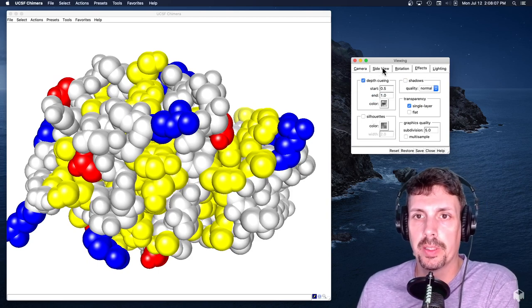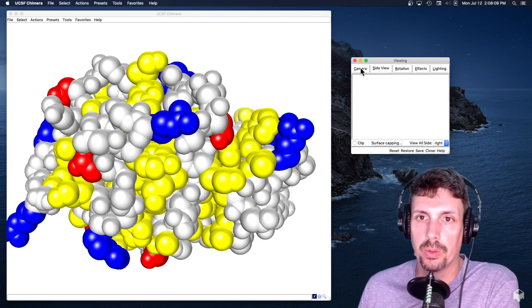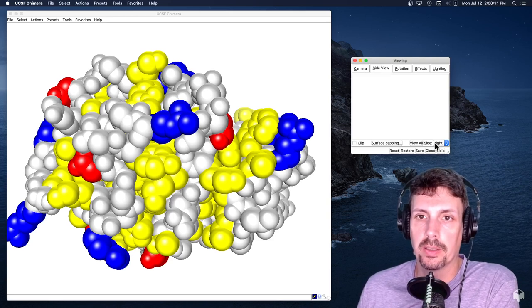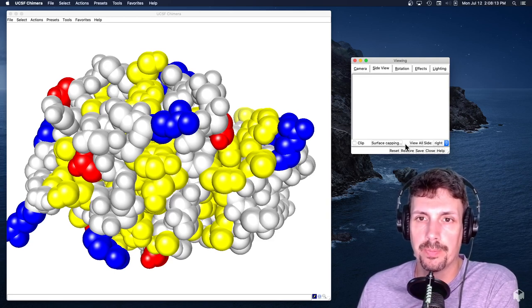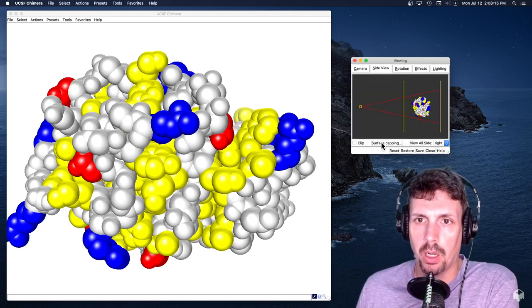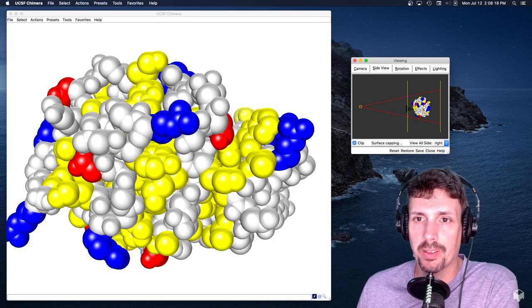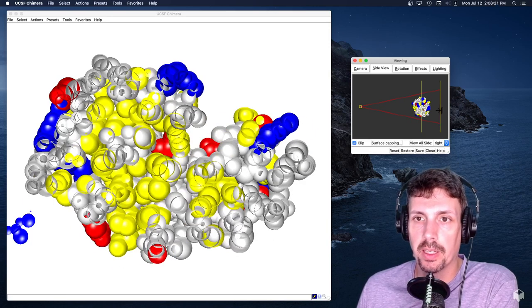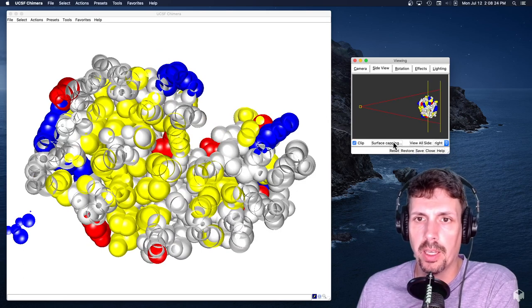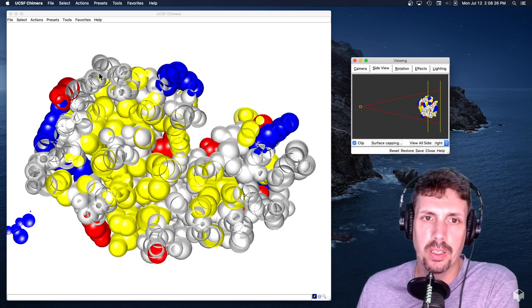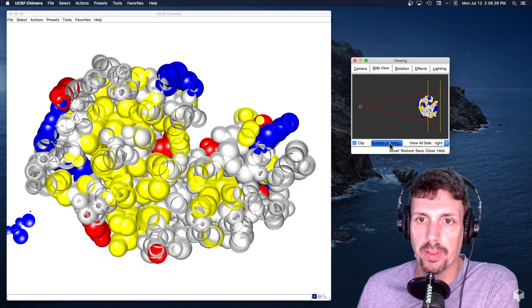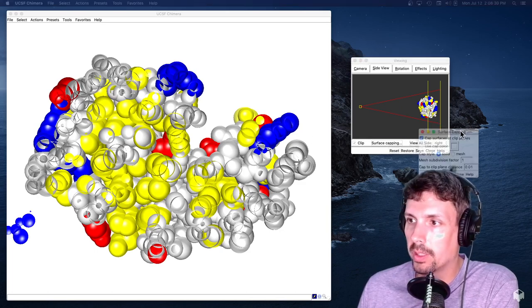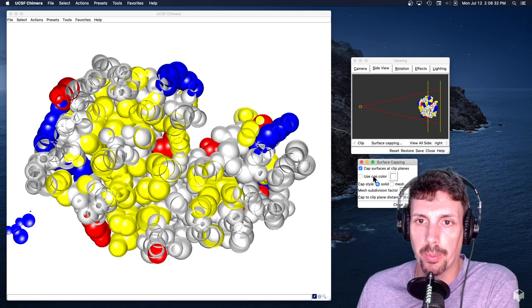So what we're going to be doing now is work on the side view. Sorry, it takes a little bit of time to load. All right. And so what I'm going to do here, I'm interested in looking at what's inside. So I'm just going to kind of slice through the middle of our protein. And it looks kind of weird because of the way we've sliced it. So the technique to do it is the surface capping.